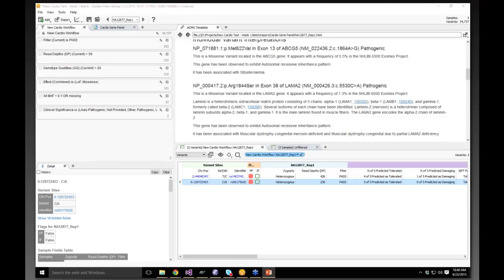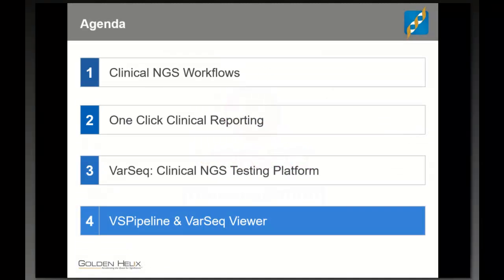So to bring it back to the big picture, I mentioned VS Pipeline because once you understand VarSeq, it makes a lot of intuitive sense why you might want to automate that one manual step I did of saying create a project, set these VCF files with this template, and then do a bunch of steps, and it computes that project. Now it only took, in this case, you can see it was in live computation, 30 seconds or a minute to finish all those annotations.